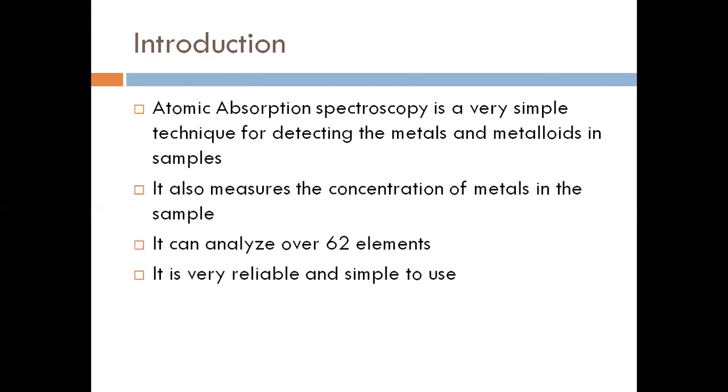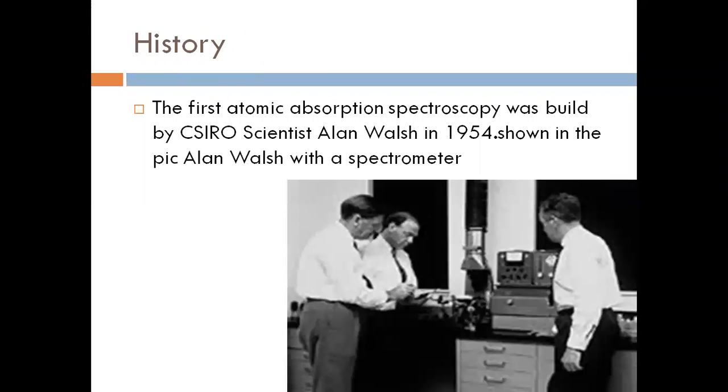So it is a very simple technique for detecting metals. It also measures the concentration of metal in the sample. It can analyze over 62 elements. It is very simple. So next is the history.